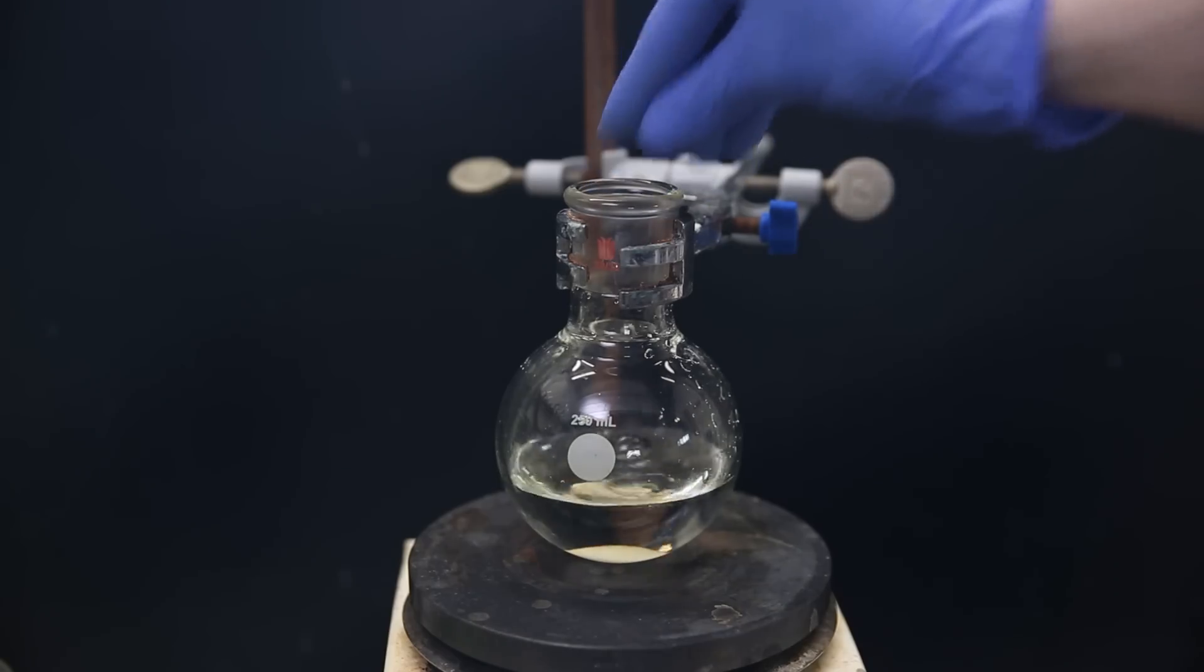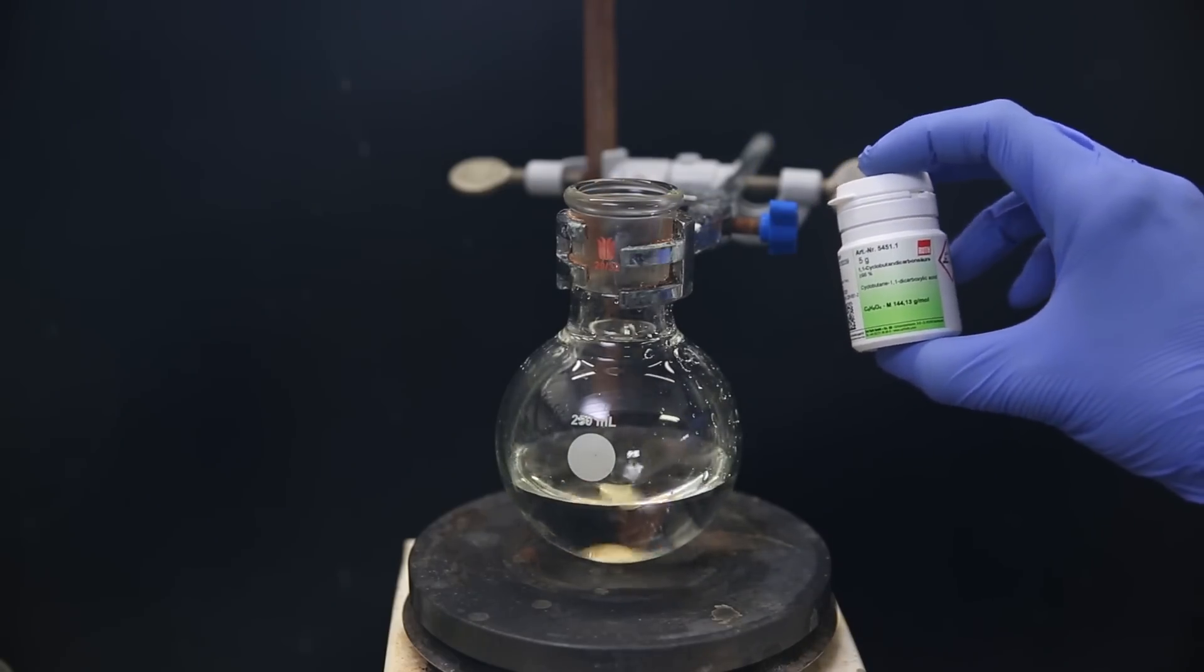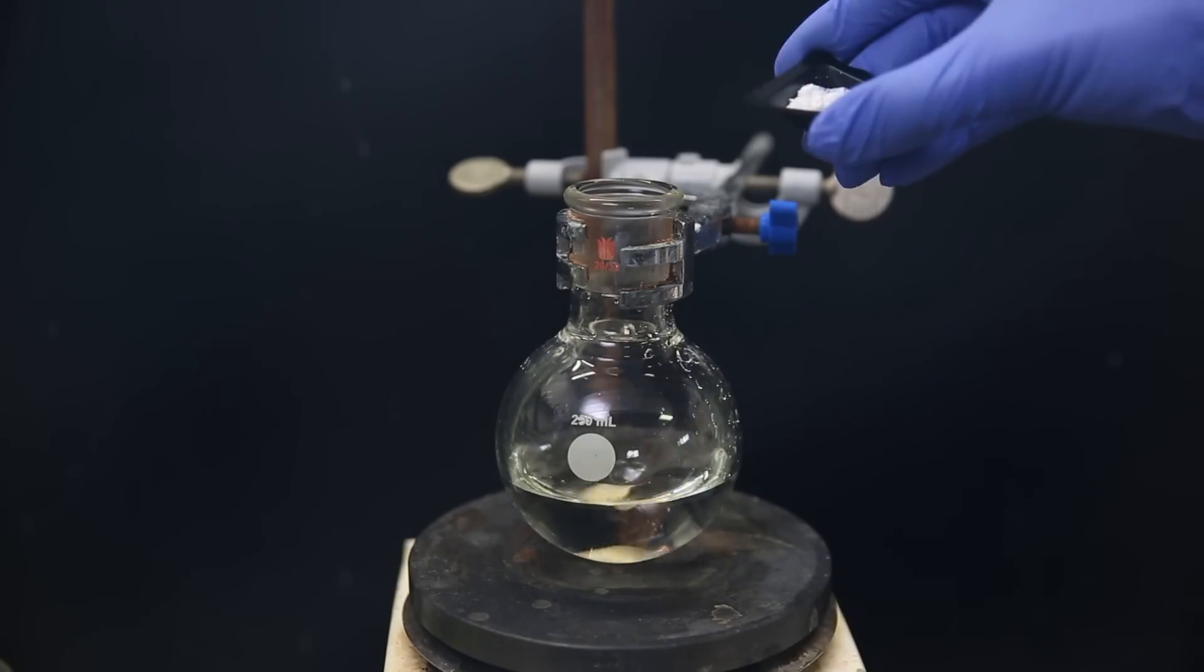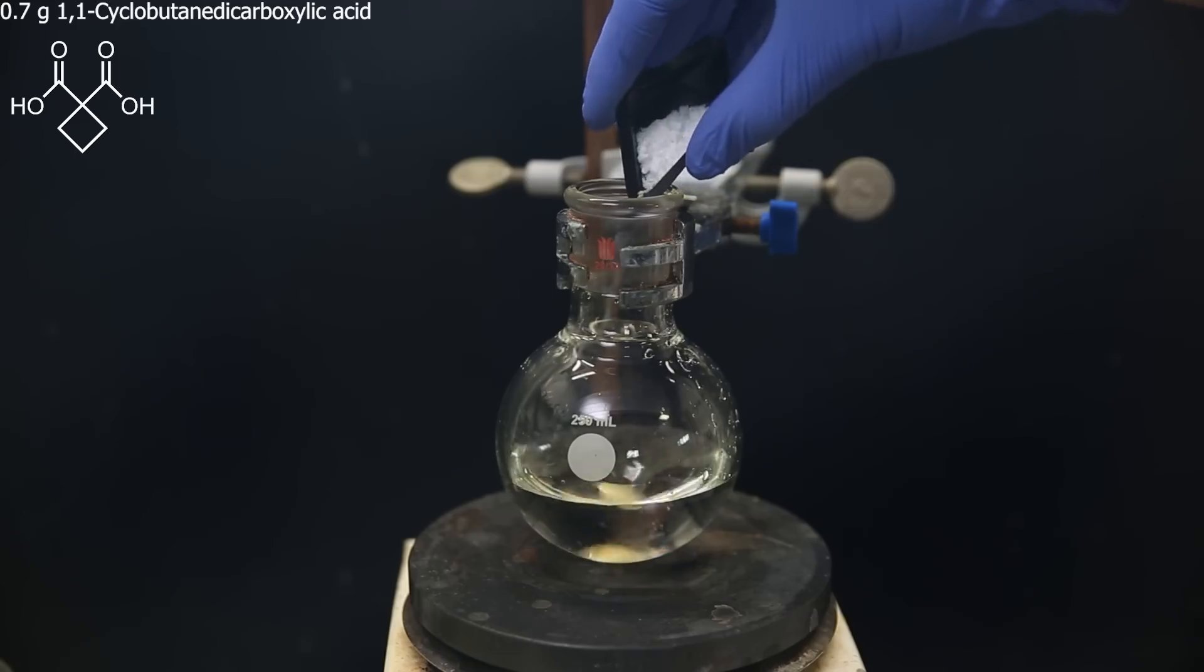So I add a stir bar, and as the final reagent, I will need 1,1-cyclobutanedicarboxylic acid. I did consider making it, but it seemed quite annoying because I couldn't find coherent literature, and it isn't too expensive to buy. So of that, I add 0.7 grams to the flask and wait for it to dissolve.